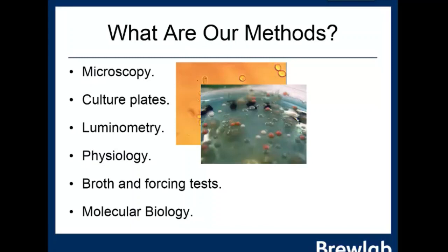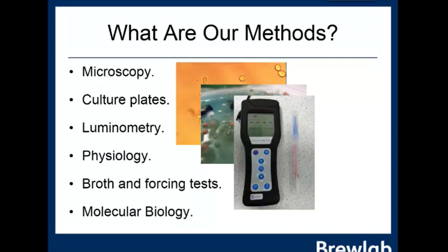So to some degree what we're thinking is, are there more rapid analysis techniques that we can use? Luminometry is one where we might be able to take a swab and put the swab into the luminometry detector and give us an indication of what level of microorganisms are present. And this would be a reasonably rapid technique. It would allow us to give fairly quick feedback to the processing. What it can't do is tell us the absolute levels. It will be comparative: if it's high, if it's low, whether we need to clean again, and so on.